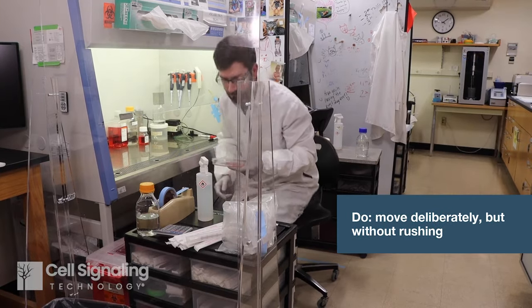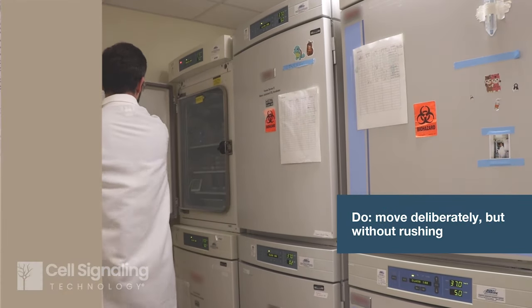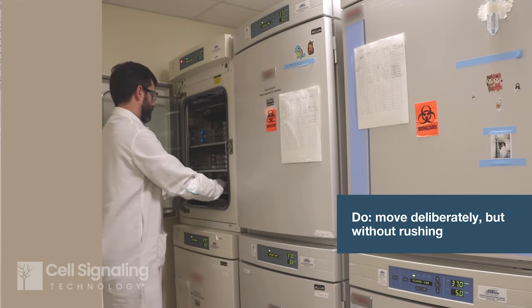Try to move through each step deliberately and efficiently, but at the same time, allow yourself enough time and don't rush, as this only makes human error more likely. As with any skill, experience and practice are key to becoming proficient.